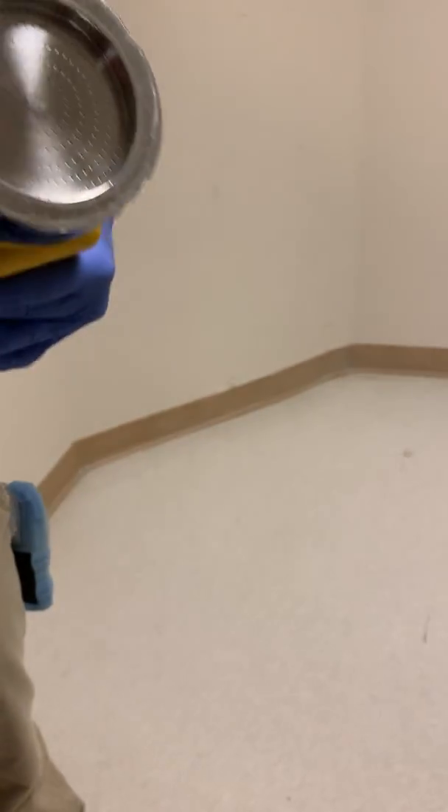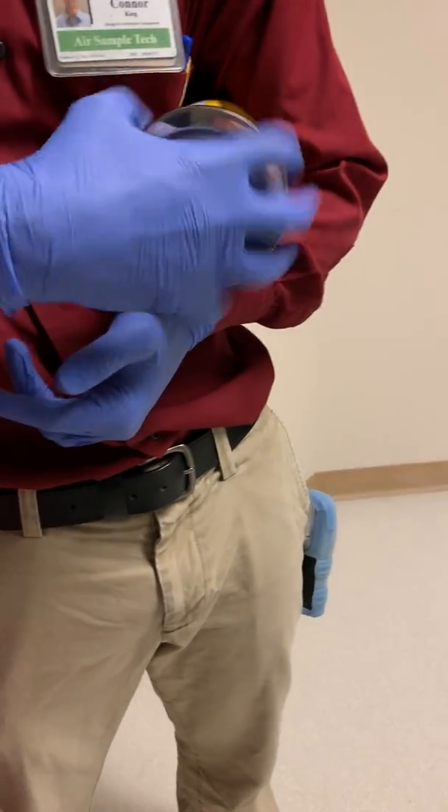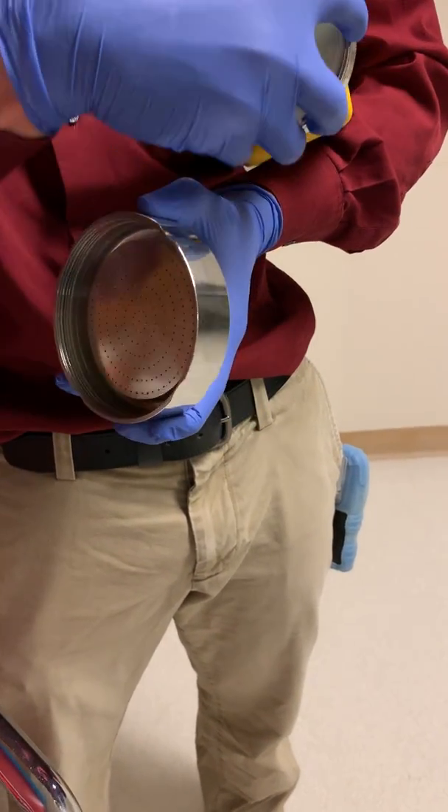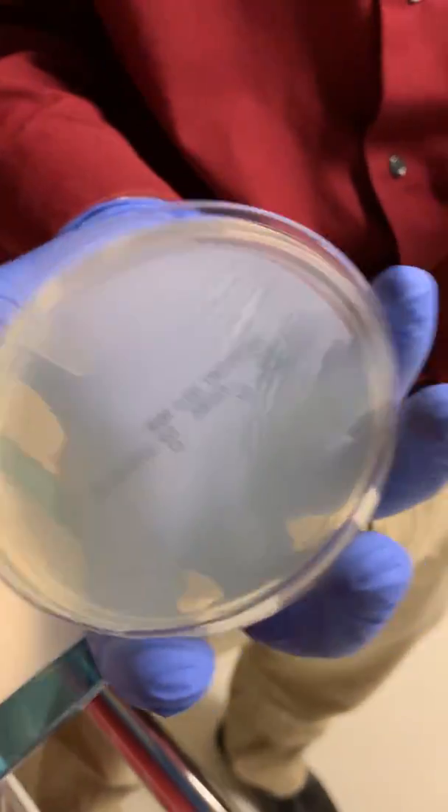We have 500 liters collected and the surface air sampler will turn off. There should be marks on the agar plate showing that the surface air sampler did its job.